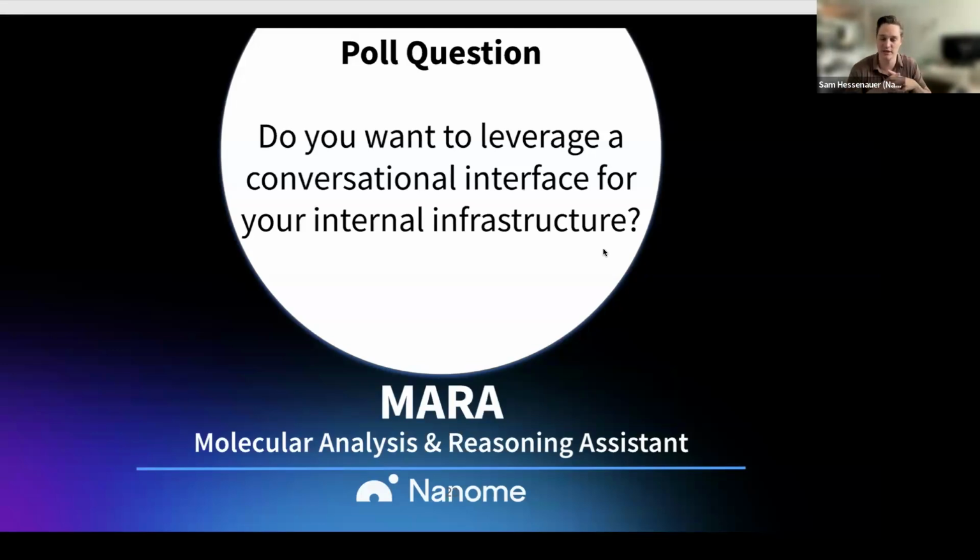That's where we think we can make the biggest impact on organizations, such that we have this informatics infrastructure tool that you can link your data, databases, and tools to, and open up this scientific co-pilot. We do want to expand a lot, like I mentioned, on the data table and using natural language to manipulate this kind of data set. And that really is going to drop the barrier to entry of informatics, data science informatics, to be a lot more focused on an average person or a bench chemist, where they can just say, I want to add a new column for synthetic accessibility score.